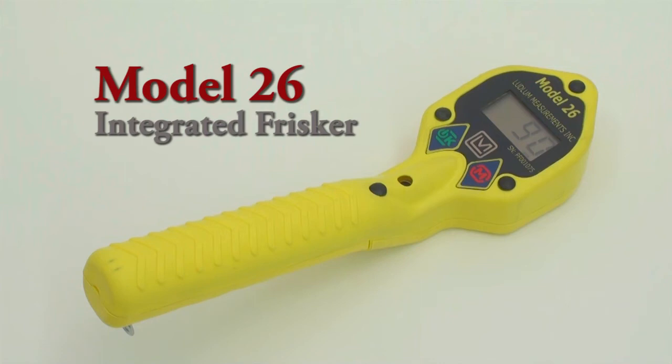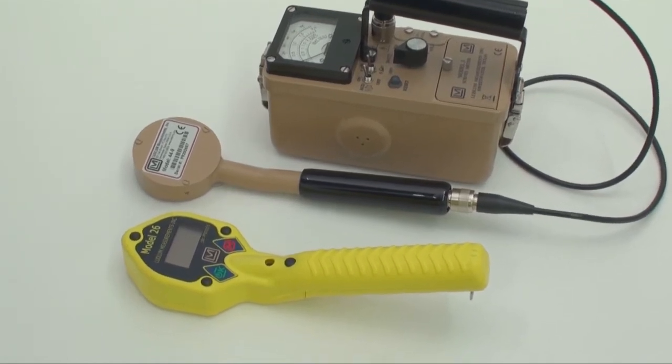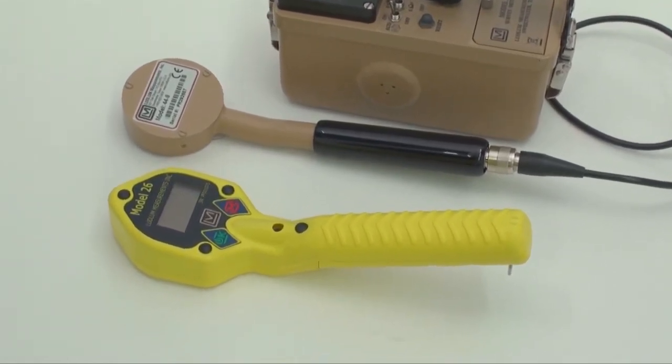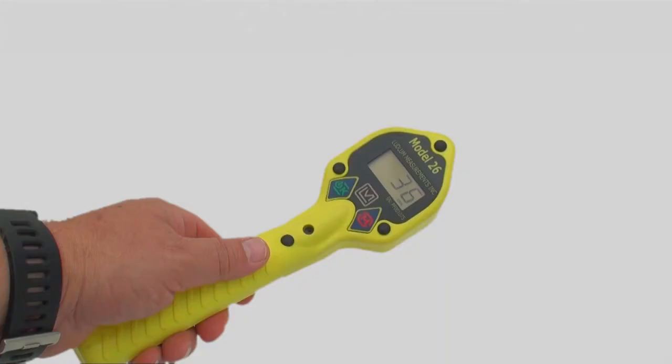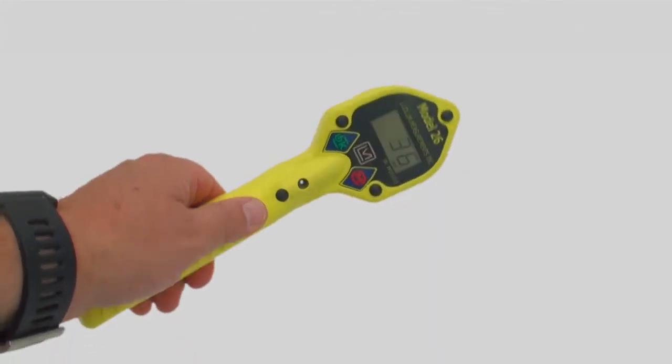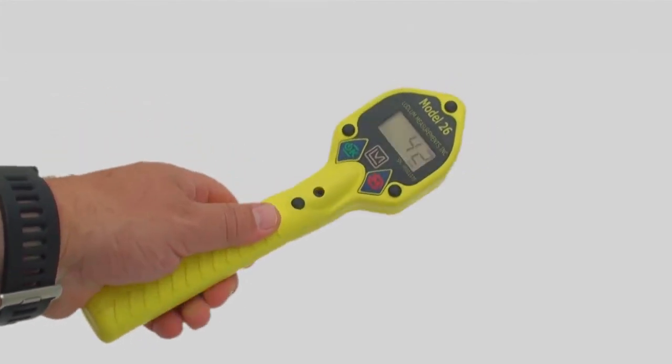Ludlum offers an exciting alternative to the traditional Geiger counter setup as a separate meter, probe, and cable, with a totally integrated design that conveniently fits into one hand. The Model 26 Frisker is an ergonomically designed package that facilitates one-handed operation, is lightweight, robust, and costless too.